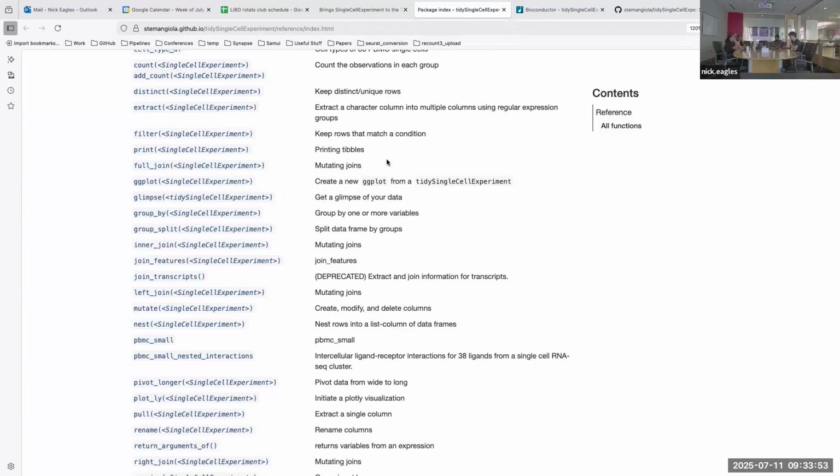The other thing I'm curious about is how it's working in depth. For example, you have the PCAs side by side with the whole data, and we know these are stored separately, as well as the TSNEs that they have together, nearby to the PCAs. So what is this kind of table? It's just grabbing the different slots and joining the information, but is it a real table?